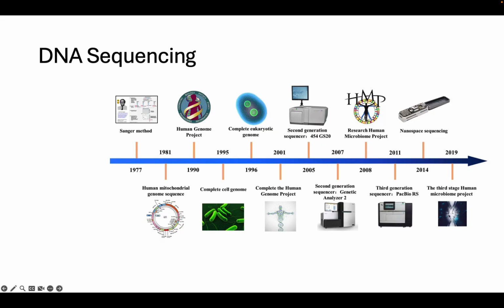And it takes advantage of the chemistry of the bases in terms of the 3' OH. So dideoxy means that there are some bases that lack the OH at that 3' location. They instead have an H, and so you get a termination of the chain. And we'll see a video about that in just a couple of minutes.